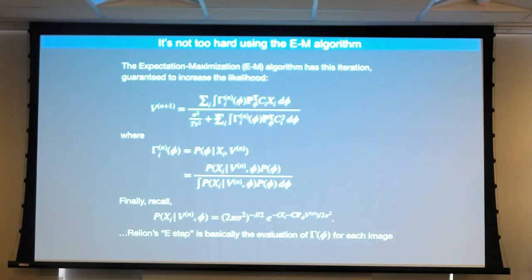So sigma squared, that's the noise standard deviation. Tau squared is the square of the voxel densities in the 3D map. And T is a parameter that you get to tell RELION to use. So this is in effect the Wiener constant. And so there are two ways where the signal-to-noise ratio of the data set is handled.